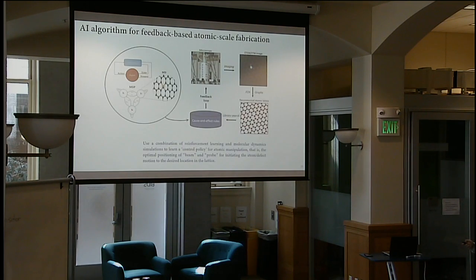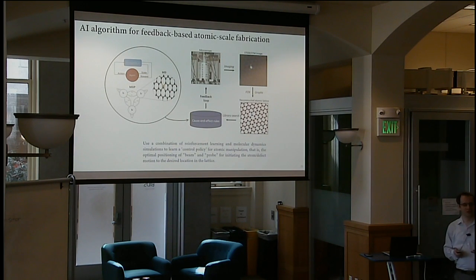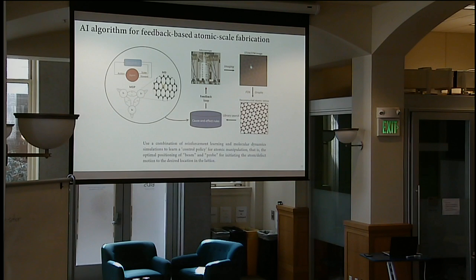And another thing, as I mentioned to you, is that what we have now are deep learning tools that allow very fast, very accurate and physics-based identification of atomic scale objects in your images. Okay, let's take it to the next level and actually make a self-driving microscope. How do we do it?